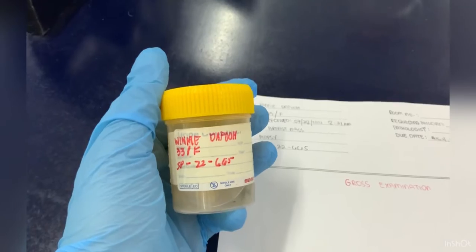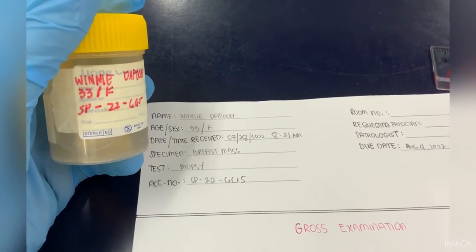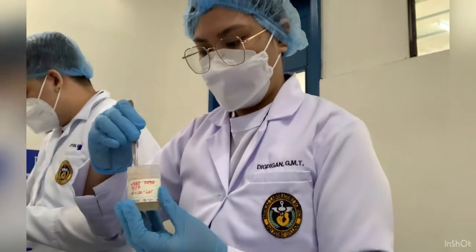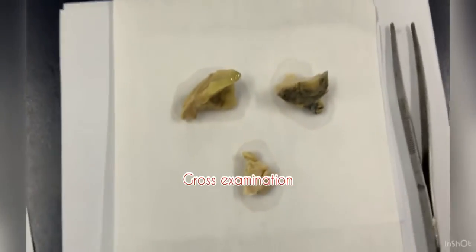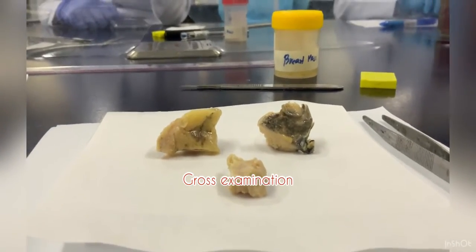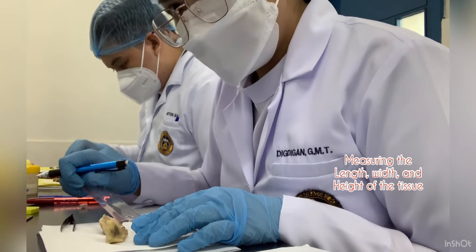Get the specimen container with label and write the patient identification on the gross examination form. The specimen consists of 3 pieces of creamy white, rubbery texture, irregular shaped pieces of tissues. Next is measuring the length, width, and height of the tissue.